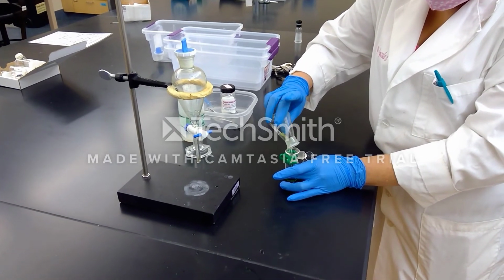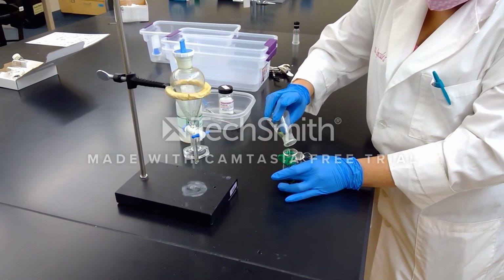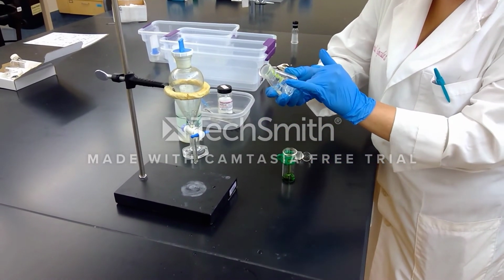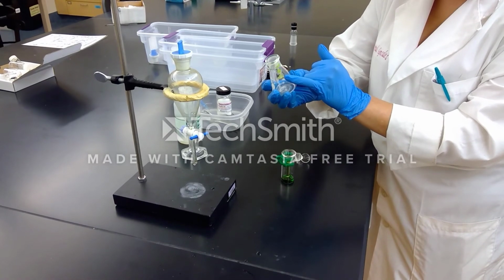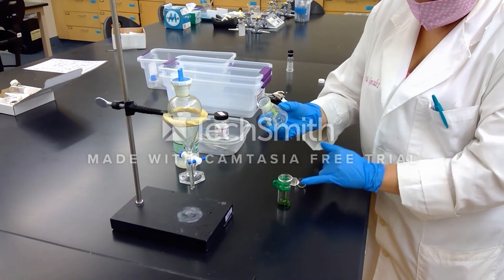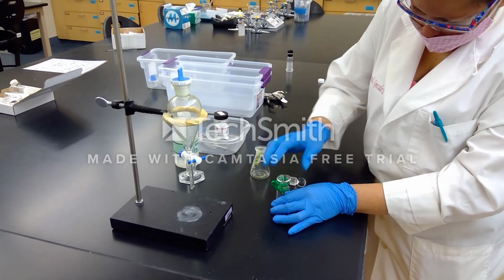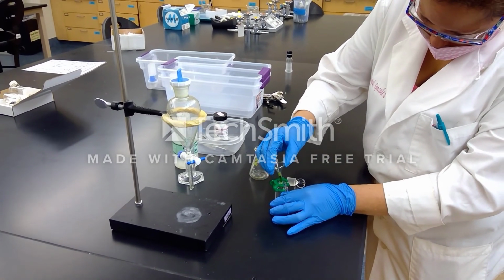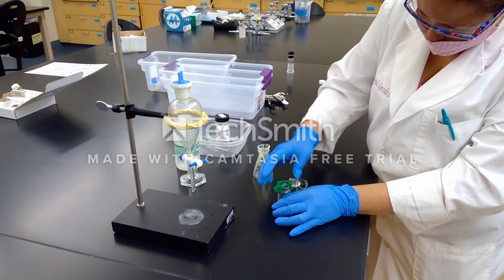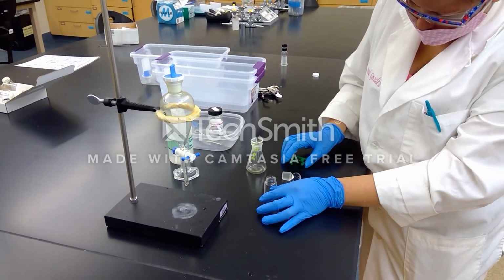Okay, so it looks like we did pretty good. And the sodium sulfate actually did pretty well in staying behind over here. If you notice, we got some grains of salt. They're green from trapping some moisture that was in the liquid here. And I'm going to try to release what I have stuck in the neck here of the funnel. Now let's go ahead and go over to the rotavap and concentrate our liquid.